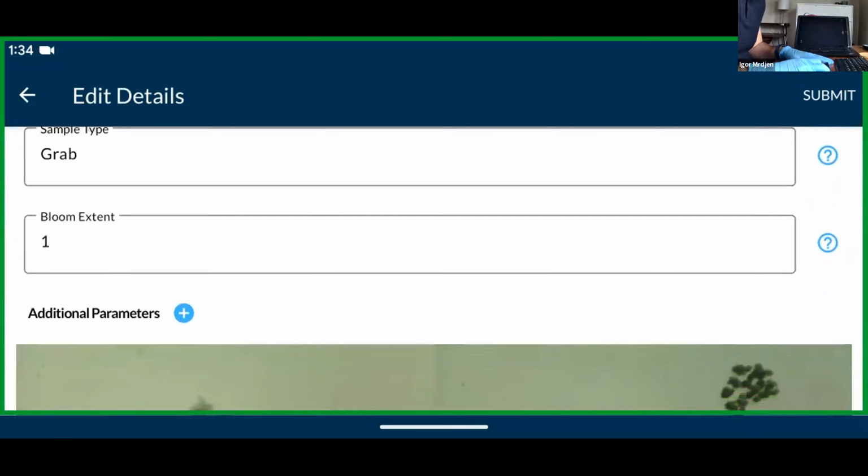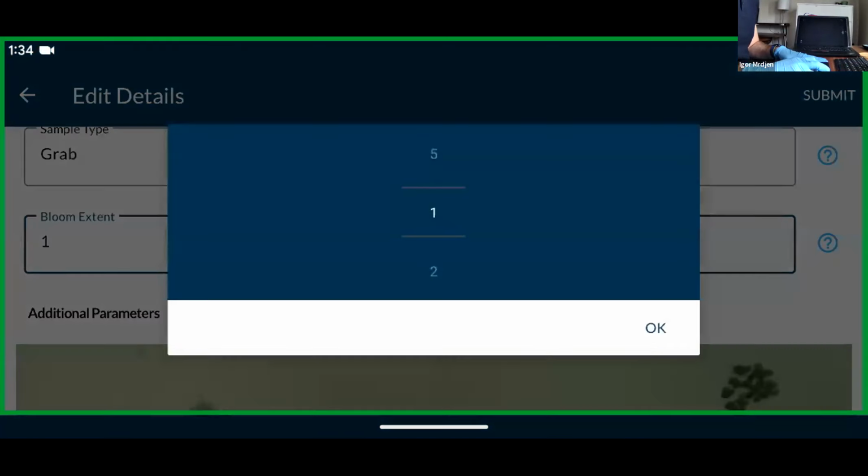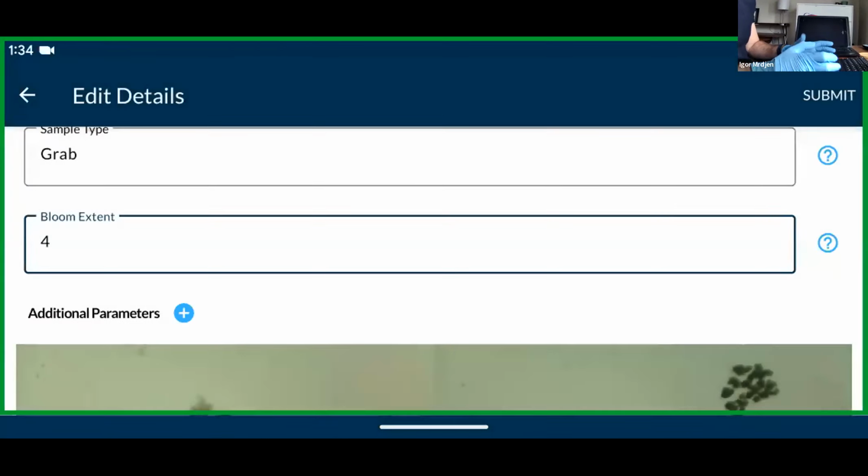Bloom extent is something that we came up with to help people communicate just how large a bloom formation on a lake is. A bloom extent of 1 is basically just little stripes of cyanobacteria that you sampled and are only found in like 10-meter formations or less. A bloom extent of 5 is basically, oh man, the whole lake is green, it's all pea soup, it's a mess. Based on our knowledge of Lake Neotwanta, I know that this is a bloom extent of 4 because a large majority of the lake was covered by the bloom, and there are already warnings out on the lake to avoid contact with the water.